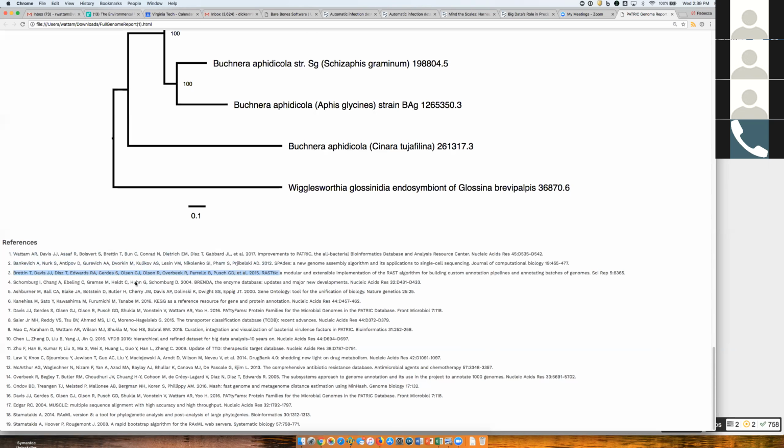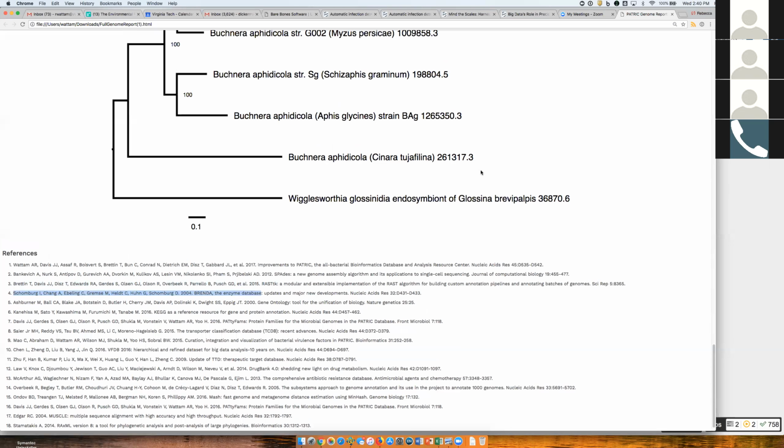If you wanted to include that you had used the EC numbers, where we get our EC numbers from is BRENDA, the enzyme database. So you can show that. I just want to make it as easy as possible for you guys to publish this information without digging through things, because I'm a biologist myself. I'm not a computer scientist, and I recognize how tough it is for people to find out what part of the pipeline was used. It's all here to make it easier for you.